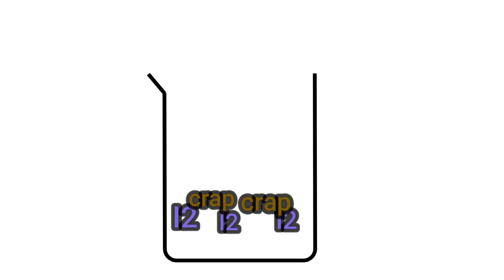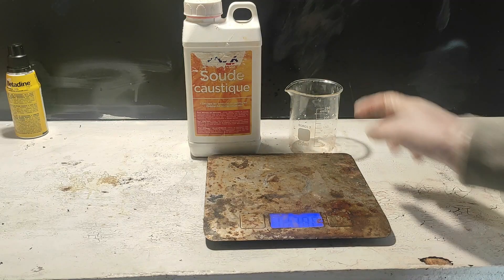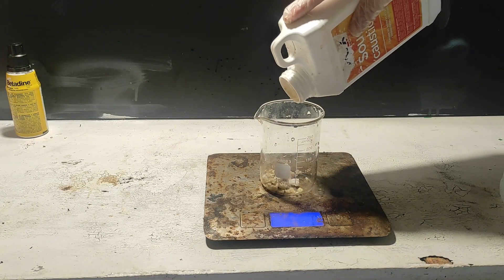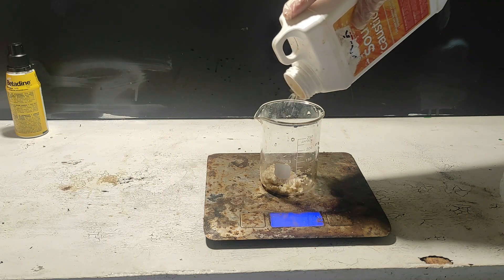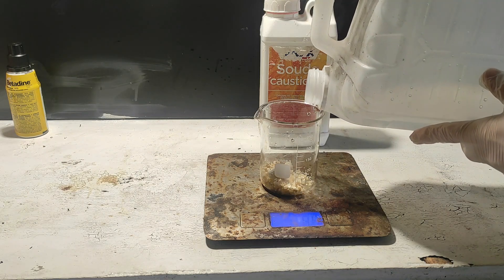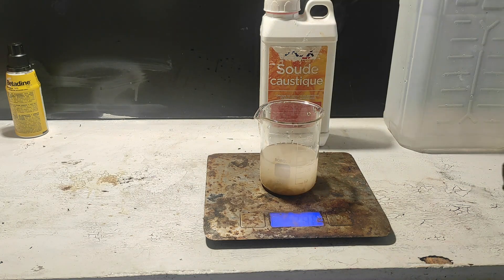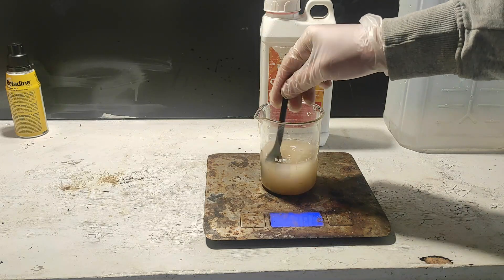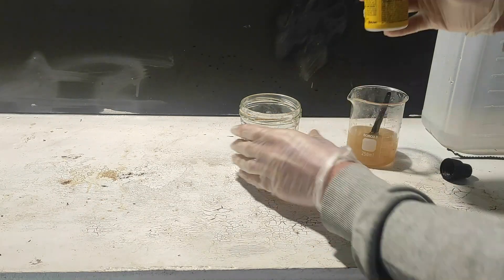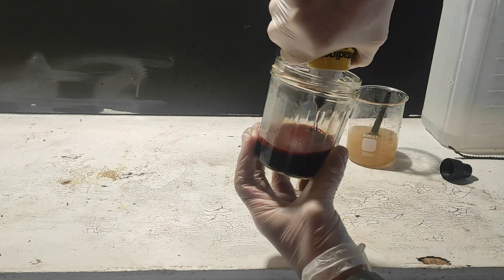To purify the crude iodine, we will also do some sort of distillation. So the first step is going to be separating the povidone polymer from the solution with a sodium hydroxide solution in water. We prepare the solution by dissolving 15 grams of solid NaOH in water. You should be careful because this is a very exothermic reaction. Also, most of the time one solution is not enough, so you will probably need to prepare the solution twice in advance, as I needed a second solution to reach the end point.